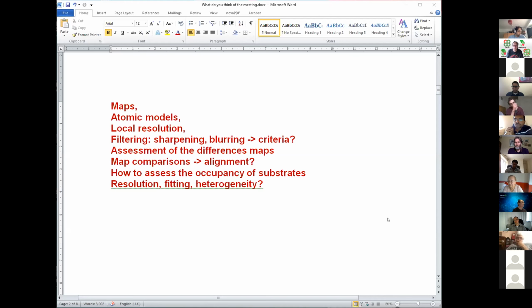That's exactly the question. Those factors are related to some kind of validation, the validation of the EM maps, differences in the EM maps, related to the validation of atomic models, and how with atomic models we can assess the differences in structure. Altogether, I think we have a bright future. We have plenty to do.